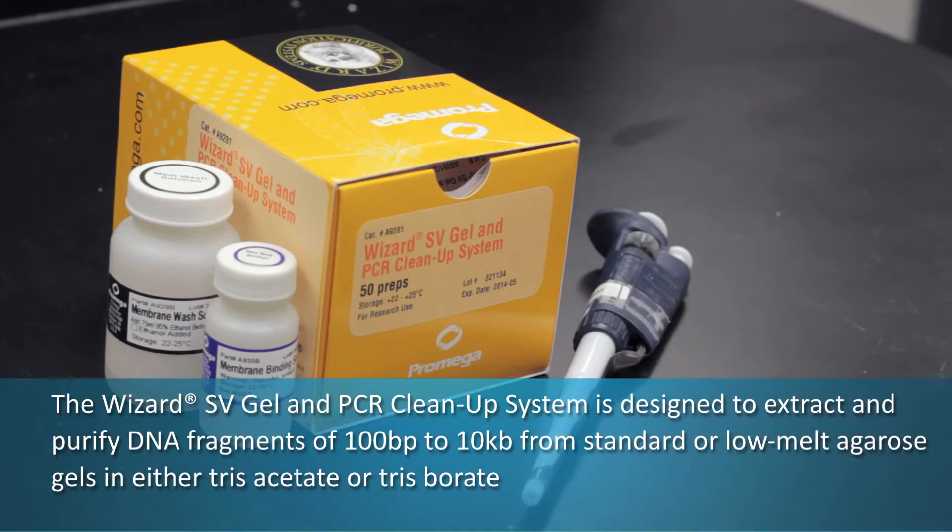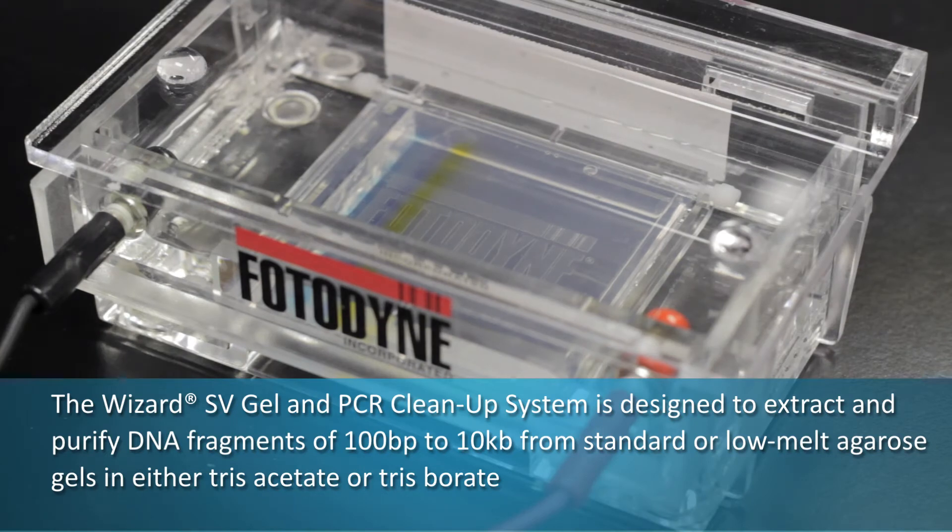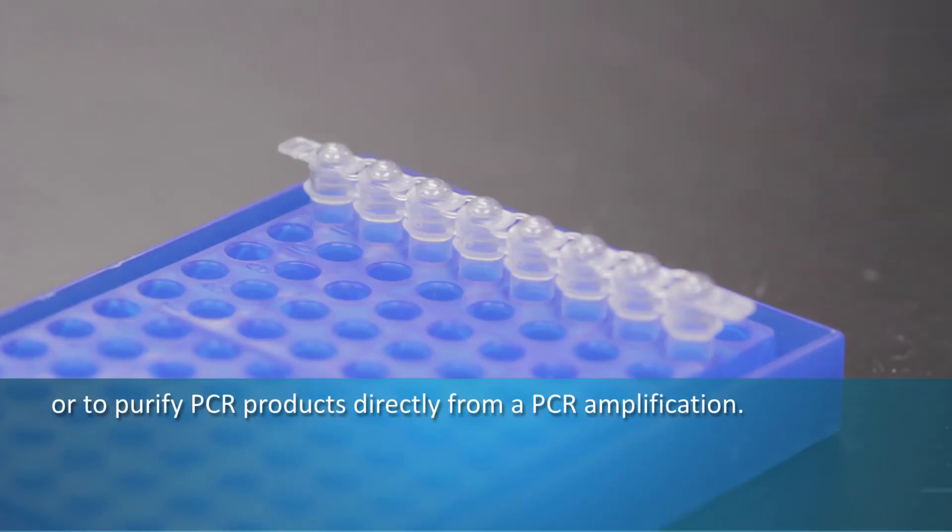The Wizard SV Gel and PCR Cleanup System is designed to extract and purify DNA fragments of 100 base pairs to 10 kilobase pairs from standard or low melt agarose gels in either tris acetate or tris borate, or to purify PCR products directly from a PCR amplification.